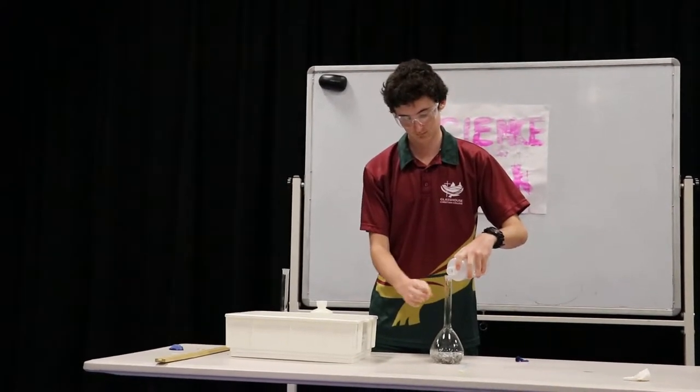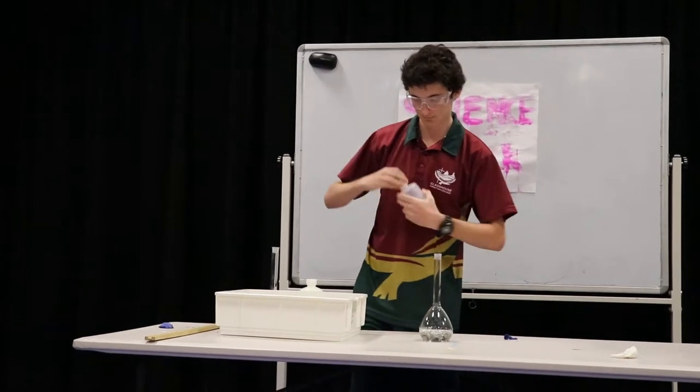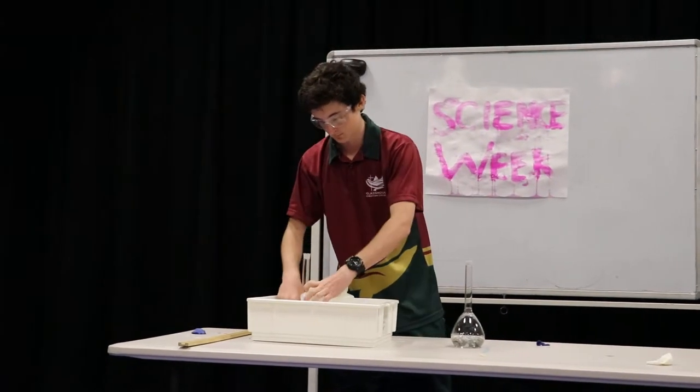So in this reaction, Jack's got a flask with some substance in there. I'm not going to tell you what it is, because you're probably trying to do this at home and blow up your house.